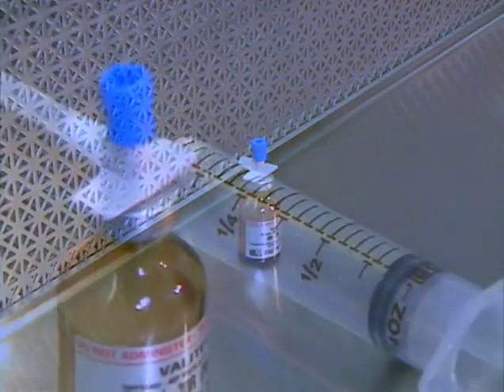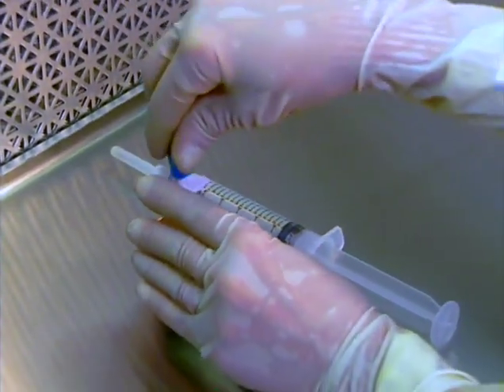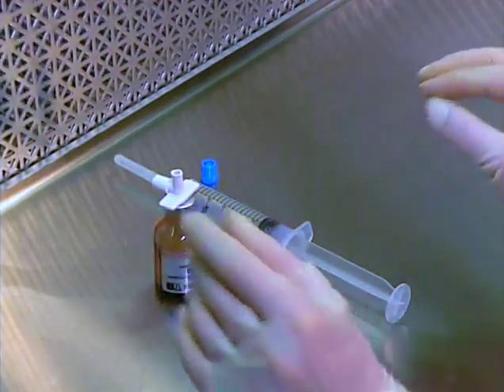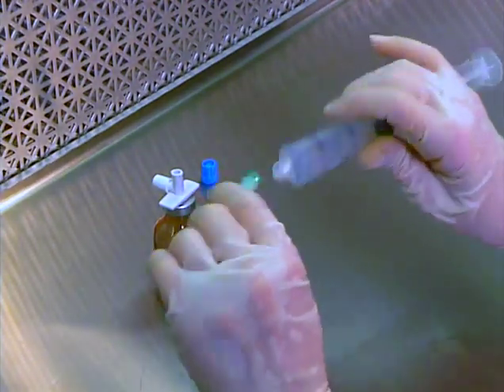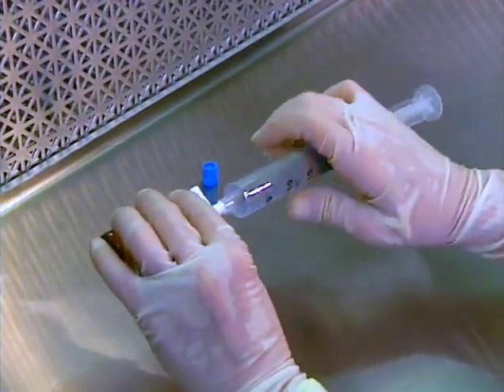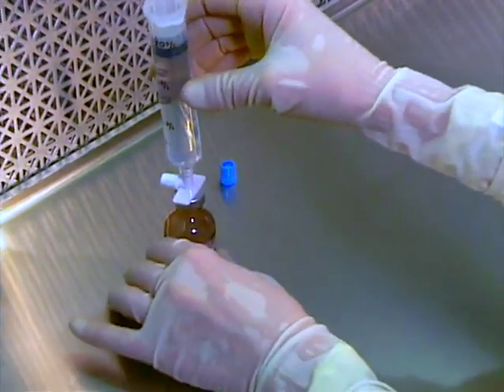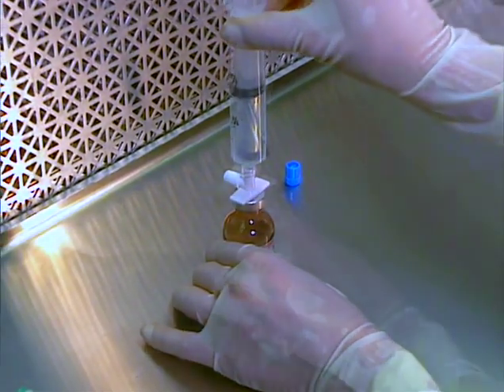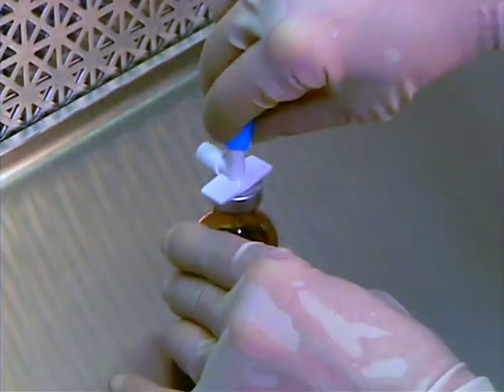If the contents are to be reconstituted, draw up the required volume of diluent in a syringe and recap the needle. Remove the dispensing pin cap aseptically and place it in first air, inside up. Hold the syringe in a near horizontal position and remove the needle. Bring the dispensing pin hub to the syringe attachment and twist to lock syringe to pin. Place the assembly on the work surface and reconstitute as usual. Aseptically remove the syringe and replace the dispensing pin cap.